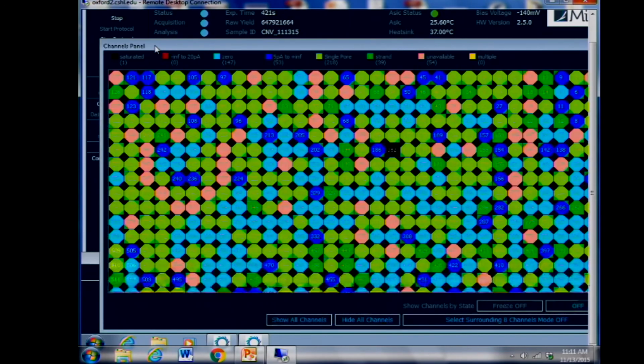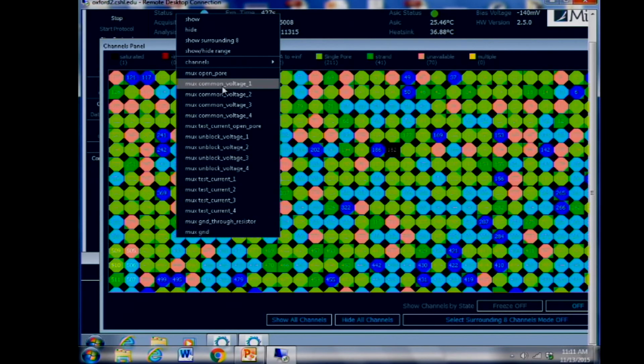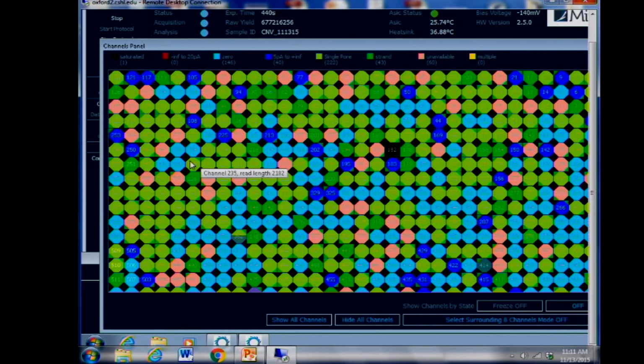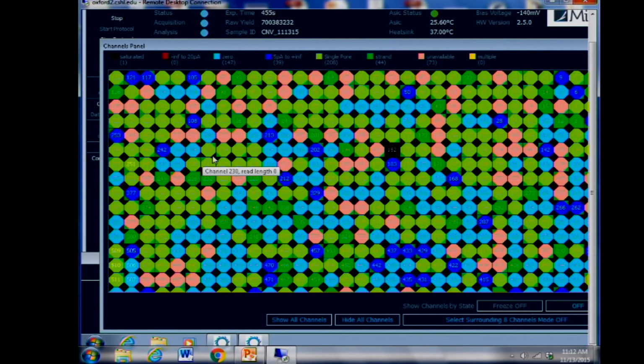Now, if you want to be particularly handy, you can also take a pore here, and you can change features of that pore. So right now, if you look at these different pores, there are little black triangles. There's one there. There's one, let's see, green triangle there, green triangle, black triangle. Those are very hard to see, but they tell you which protein within the group of 4 is being used to collect data. So this is 1, 2, 3, and 4. Okay, so group 1 are all the good proteins, but there's 4 proteins within a channel, and one of those 4 proteins is group 1.